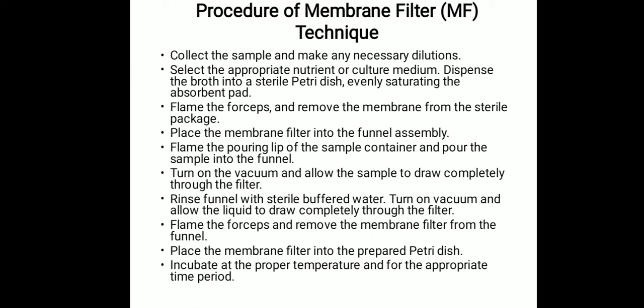After all this is complete, we incubate at the proper temperature and for the appropriate time period. Then after we incubate, we count the colonies under 10 to 15x magnification, and we confirm the colonies and report the results. So these are the steps involved in the MF technique.